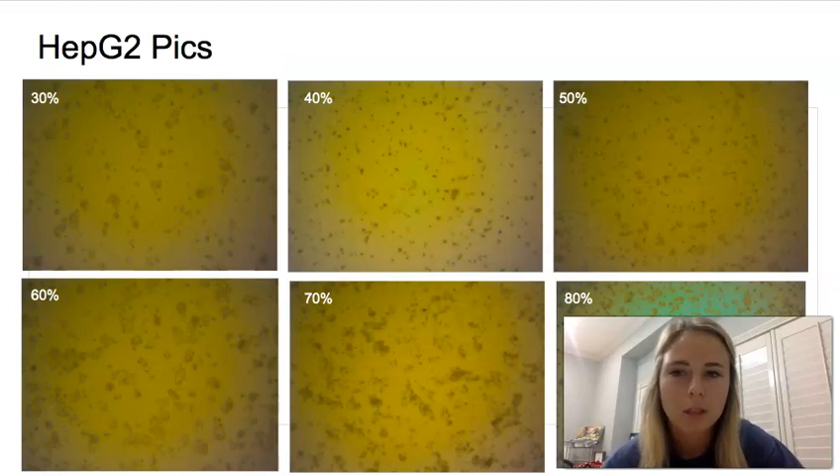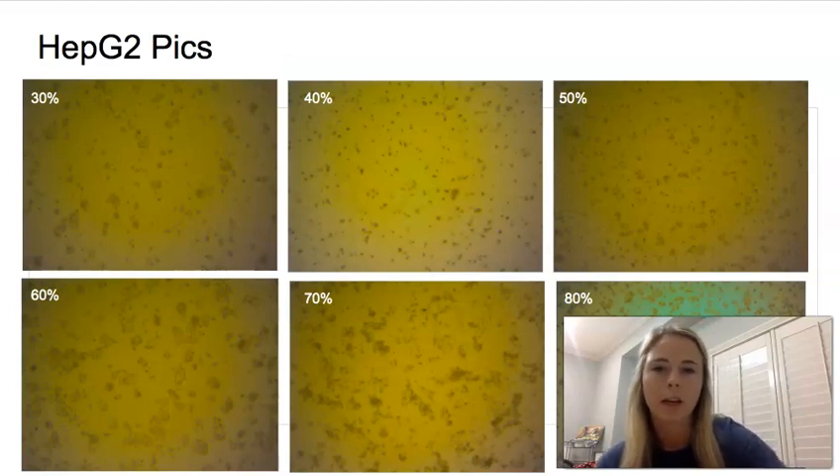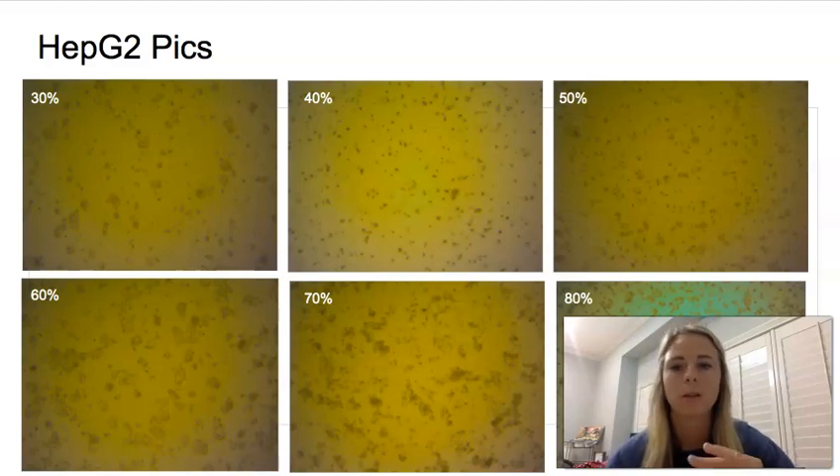Here are some pictures we took when growing the cells. You can see the 30 and 40% have quite a few clumps, but they're really spread out with a lot of space between them. Then in the 70 to 80%, there are a lot of clumps also, but they're a lot closer together. So those are at a higher confluency.